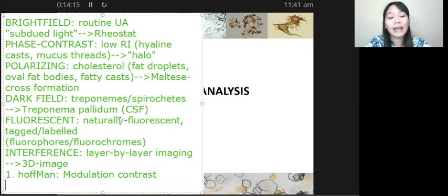All right. And then the other interference microscope, we have your Nomarski. For your Nomarski, what we capitalize or underline is the letter R. So, letter I. Okay, it can also be letter R. Letter R or letter I. Why? Because the specific mechanism involved in your Nomarski microscope is differential. Okay, so we have differential interference contrast.